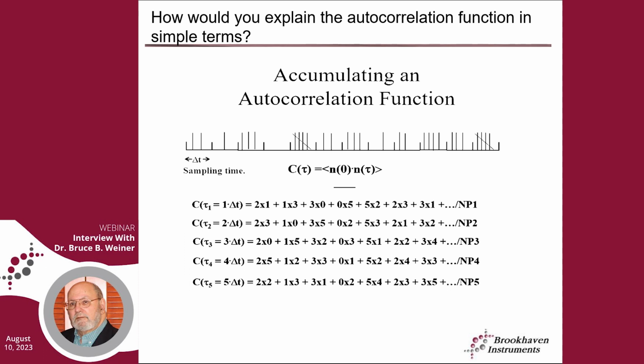At some point in the mid 80s, we were able to automate all that. Before that, people who knew light scattering would typically have a rough idea of where to place the sampling times, but more importantly, they'd simply measure an initial correlation function. They'd notice whether the baseline was coming down to a flat portion. If not, they'd start over with a longer sampling time. If they noticed that they weren't catching the beginning of the correlation function very well, then they would stop, delete, start over with a shorter delay time. So you did it by understanding the procedure.